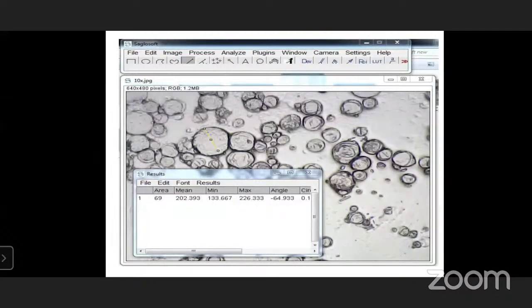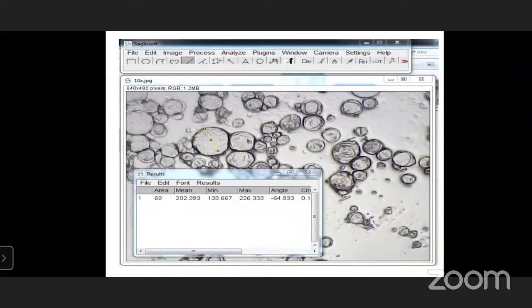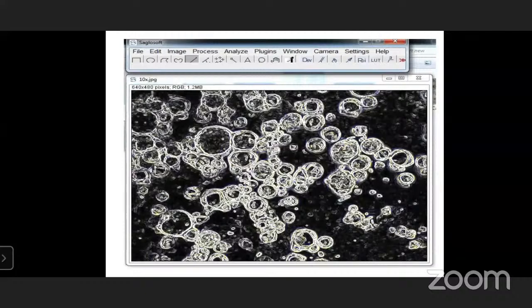मग आम्ही एक असा सोर्स कोड डेव्हलप केला की त्याच्यामध्ये डार्क फील्ड मध्ये कन्वर्ट करता येईल. तर हीच इमेज आम्ही काय केली, फक्त डार्क फील्ड मध्ये कन्वर्ट केली. त्याच्यामध्ये अनालाइज अँड कन्वर्ट इनटू द डार्क फील्ड एक बटन आहे, कन्वर्ट टू डार्क फील्ड. Once you click the convert into dark field microscopy, then you get this type of images. ओके, याच्यामध्ये हे मायक्रोस्पियर मध्ये तुम्ही बघू शकता, सॉरी मायक्रोस्पोर्स मध्ये आपण मायक्रोस्पोर म्हणजे काय म्हणतो की असा एक स्पियर आहे की त्याच्यामध्ये छोटे छोटे स्पोर्स आहेत, त्याला म्हणतात मायक्रोस्पोर्स. गोल जे मायक्रोस्पियर आहे याच्यामध्ये पण छोटे स्पोर्स आहेत. ते यू कॅन कन्फर्म दिस इज द मायक्रोस्पोर बाय युजिंग दिस डार्क फील्ड मायक्रोस्कोपी.